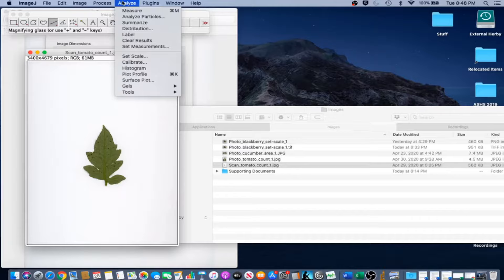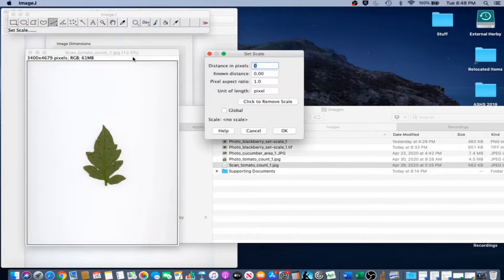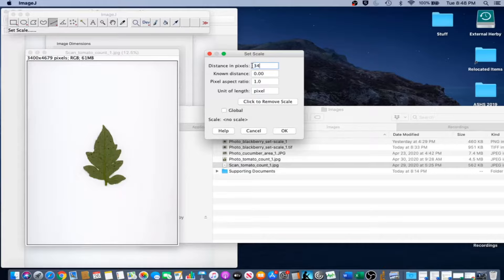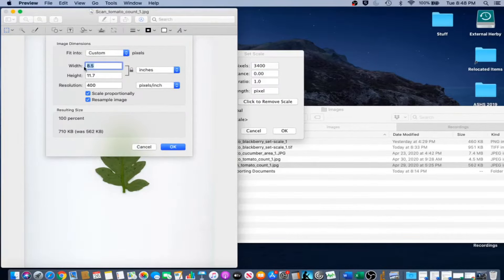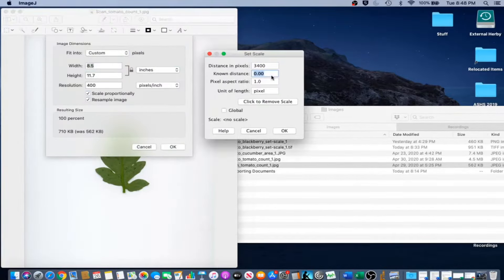Next, we're going to go to Analyze, Set Scale. Notice that the pixel dimensions for the image are listed in the upper left corner of the image in ImageJ. Enter 3400 as the width of the image in the distance in pixels. Then go back to our preview page — we notice that the width of the image is 8.5 inches. We're going to put 8.5 and then fill in inch for unit of length. If you have a whole set of images that are the same scale, go ahead and check the global box. If not, just click OK.